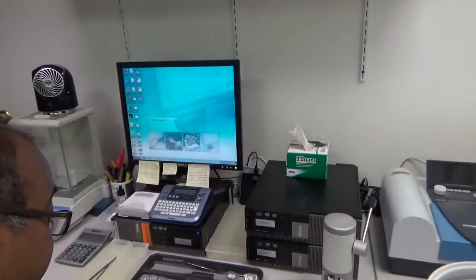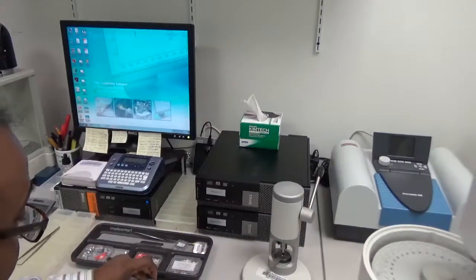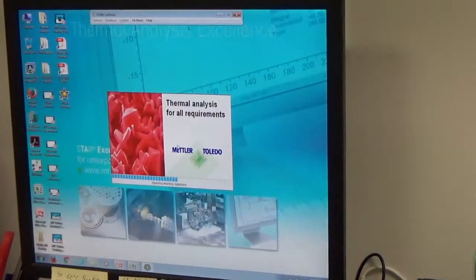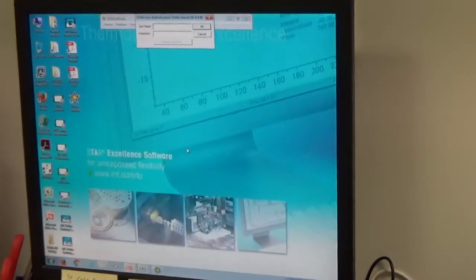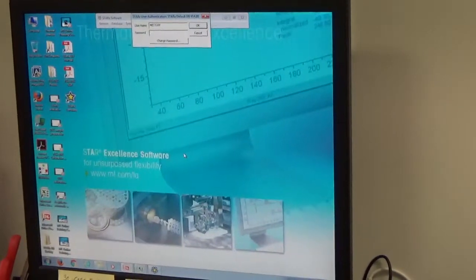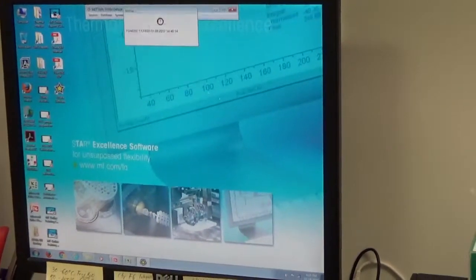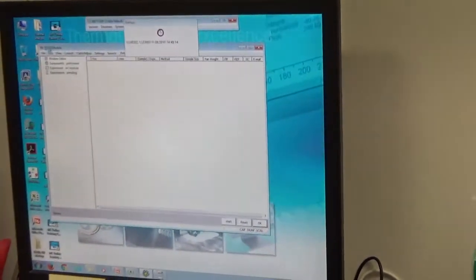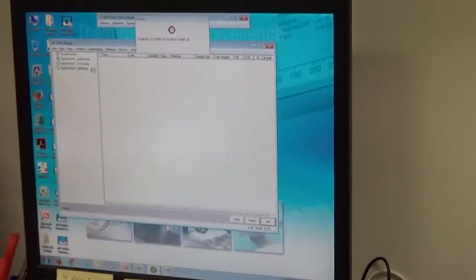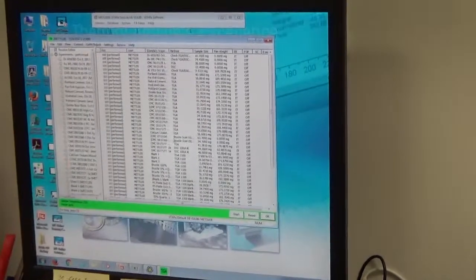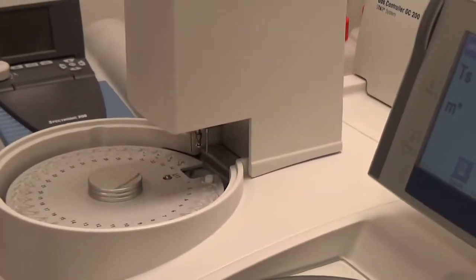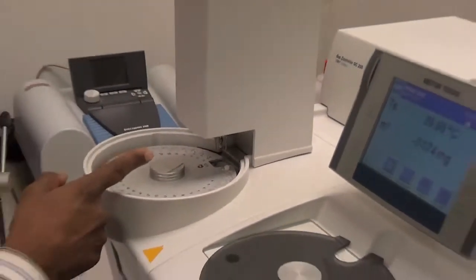To start the thermal analysis software, we go to the STARe software. The STARe modules open where you have the routine editor, and it gives a green bar at the bottom indicating it's in power-safe mode. The software finds the robot, and once the software communicates with the robot, the furnace opens.